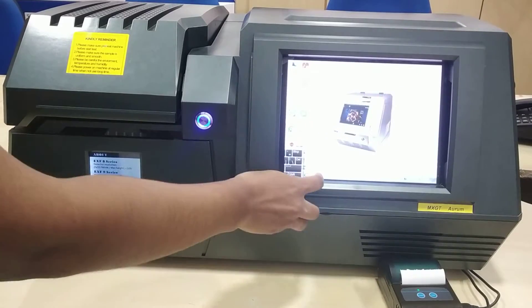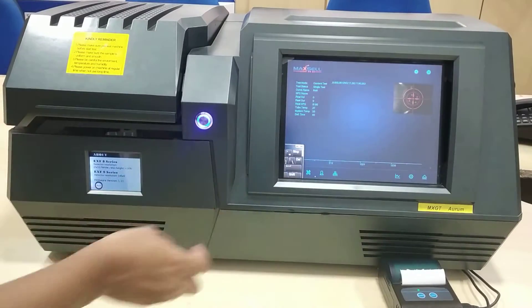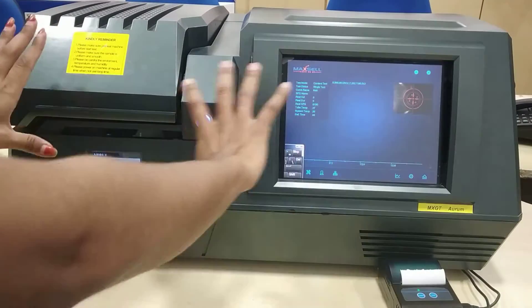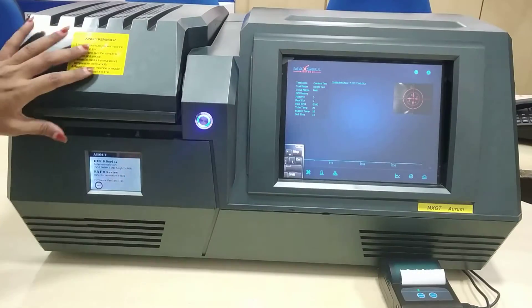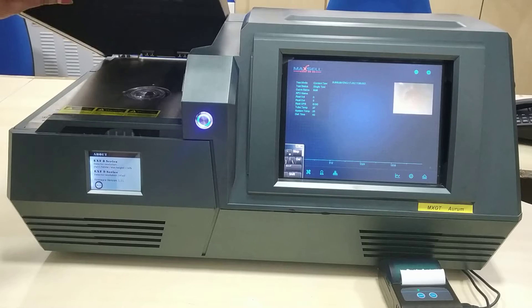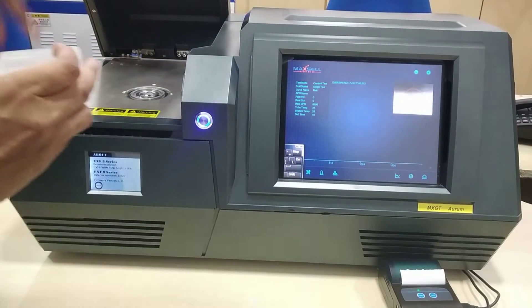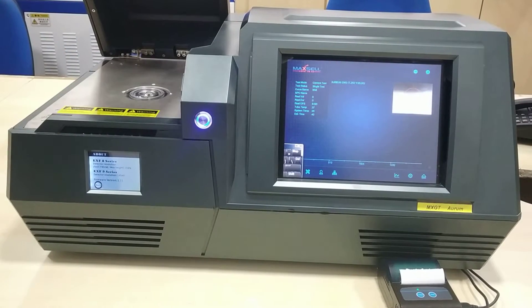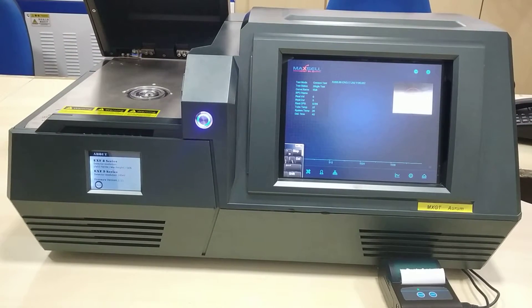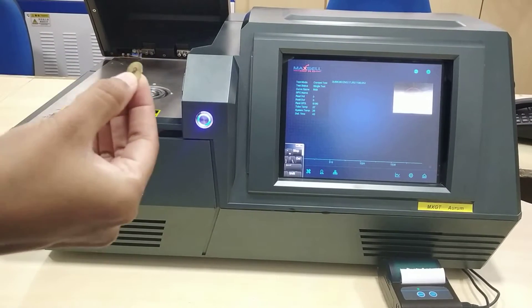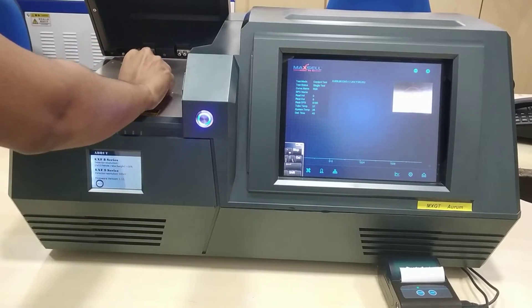Hi, this is our mission and this is the testing software. I'm going to check an iridium sample, which is a meltdown sample. I'm going to place it now.